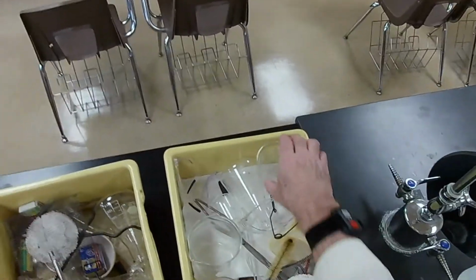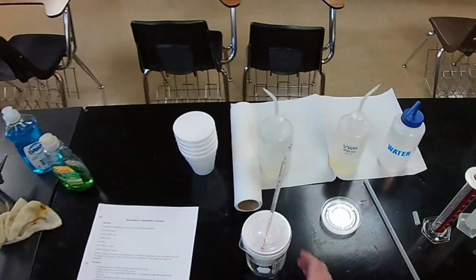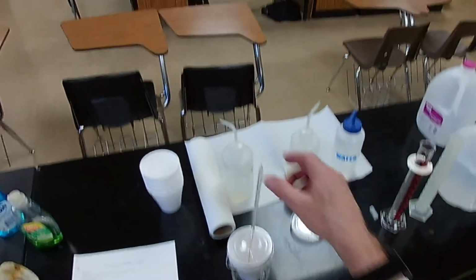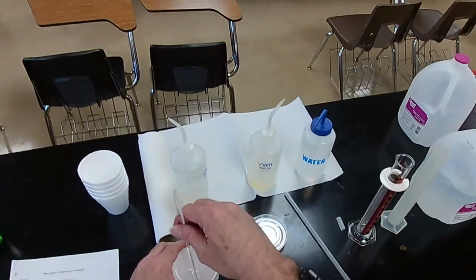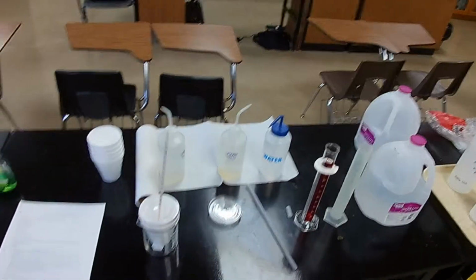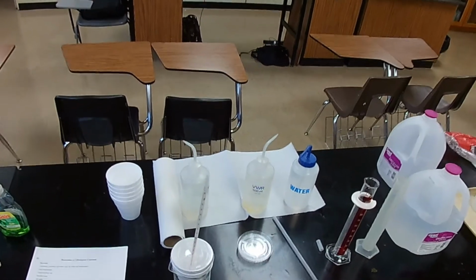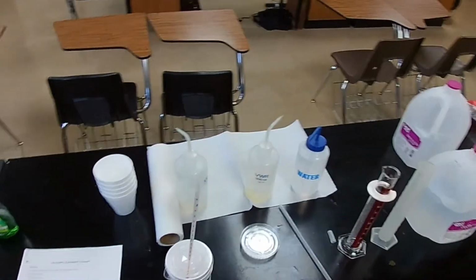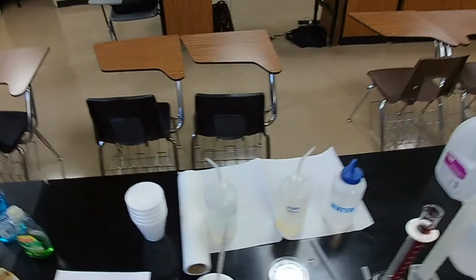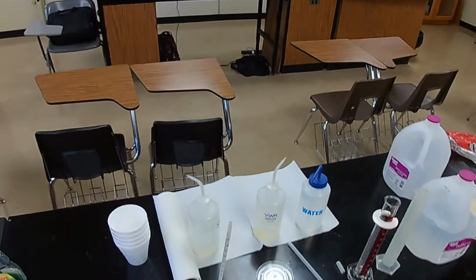That would work. Let's see if this one works better. Yeah, this one works better. Okay, this is just to hold the calorimeter because styrofoam is so light and glass is heavy, it would tip over, and we don't want that. Okay, so that's our calorimeter. Now, once you've constructed your calorimeter, you cannot change anything about it. You cannot use a different thermometer, you cannot use different cups or lids, because we're going to determine the constant that's applicable to that calorimeter and none other.